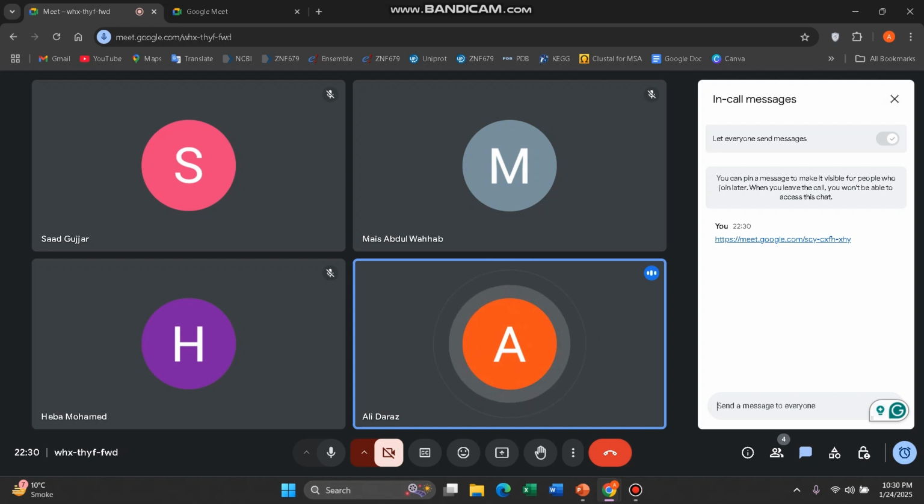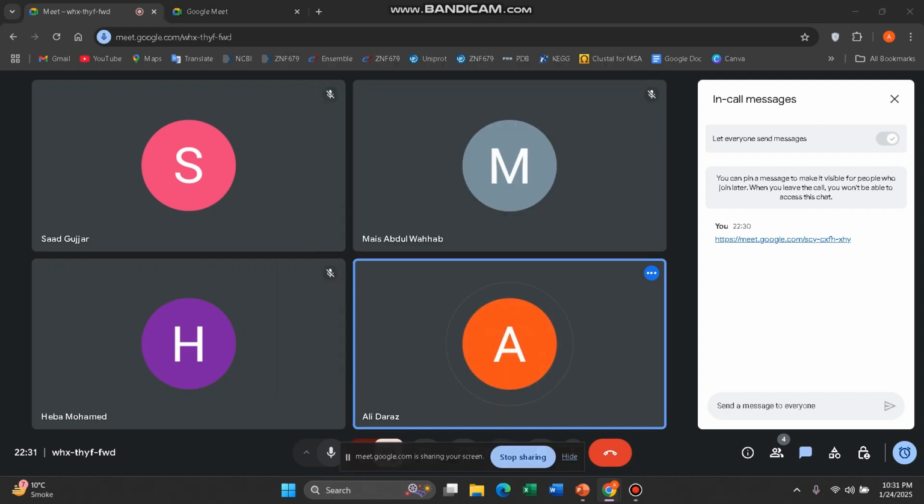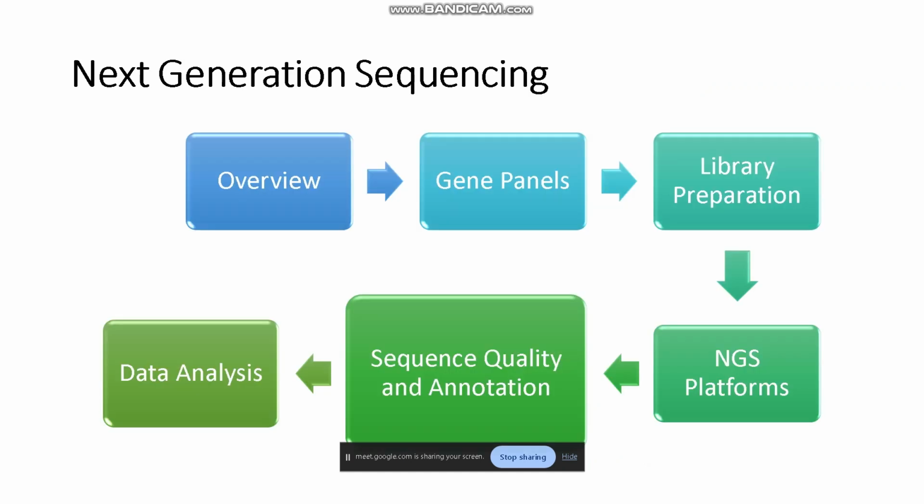Okay, I think no one has a question, so let's continue the next part of the NGS. The next part of the NGS is sequence quality and annotation.